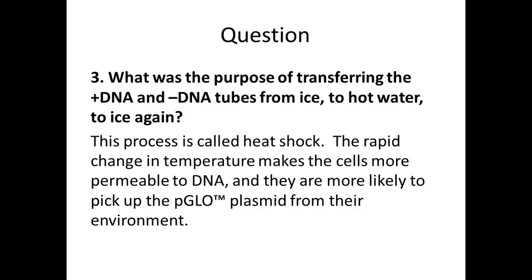You go where they have a hot tub and a pool. You ever jump back and forth between the hot tub and the pool? It's kind of shocking to the system. That's literally what we're pretty much doing to our bacteria today. We're going pool, hot tub, back to the pool. We're going to shock the system, and we're using temperature to do that.